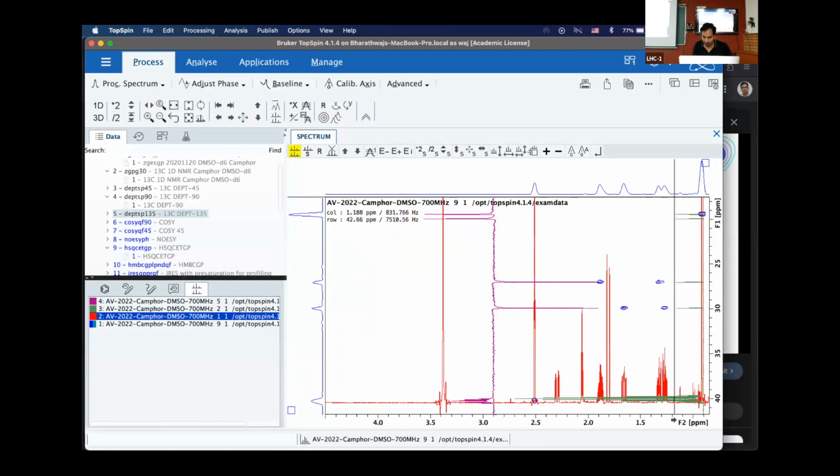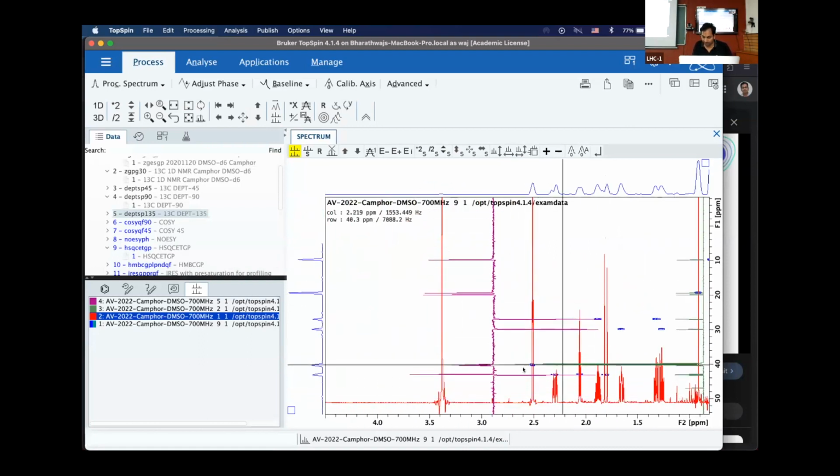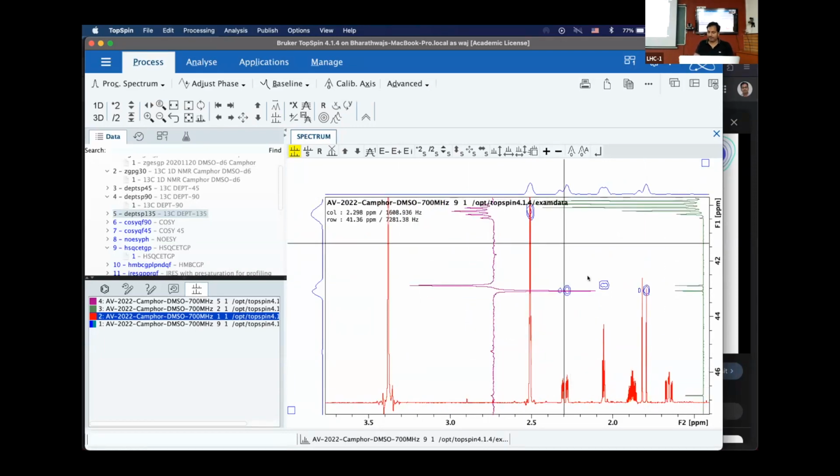And remember, we saw one more methylene proton farther away in carbon, which is close to the CH, right? This was a CH, which is only giving 1 proton again. This is a CH2. So you're confirming that the carbon still has 2 protons by also this experiment. So this way, what you have done, yes, you have carefully mapped which carbon has which protons. We still do not know within the chemical structure, where do these methyl groups come up? Right? But you have identified which is methyl, which is methylene, which is methine, and which is quaternary carbon.